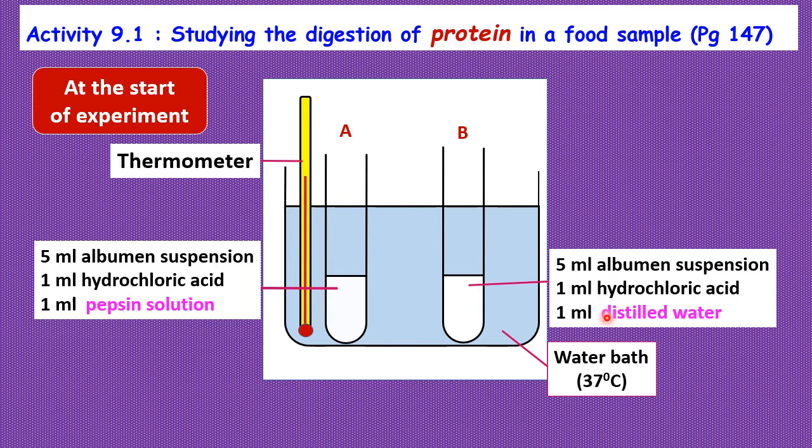So at the beginning, both these test tubes contain the albumin suspension, which is turbid or cloudy. It looks a bit opaque. It's something like when we add some liquid milk into a cup of water, it'll turn cloudy, whitish and a bit cloudy, due to the albumin suspension. So let's see what happens after 20 minutes of leaving these two test tubes in the water bath.